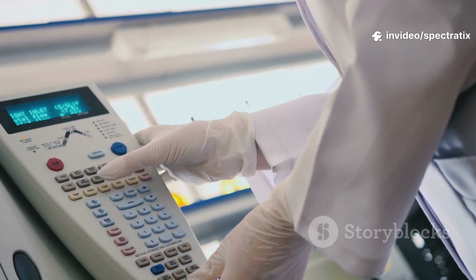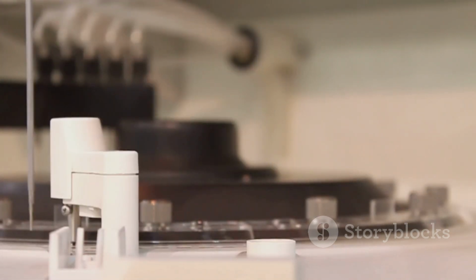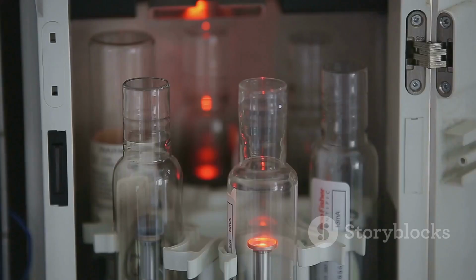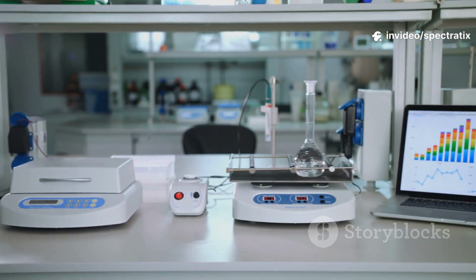As the separated compounds exit the column, the detector picks them up. Flame ionization detectors and thermal conductivity detectors are among the most common. Each detector has its own strengths, depending on what you're looking for. Let's talk applications, because GC is everywhere.